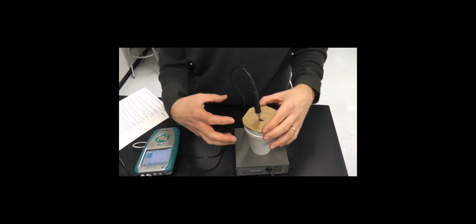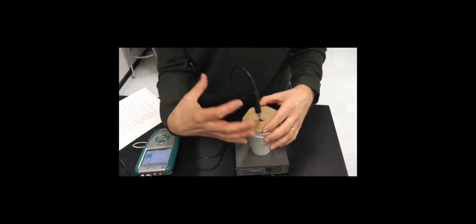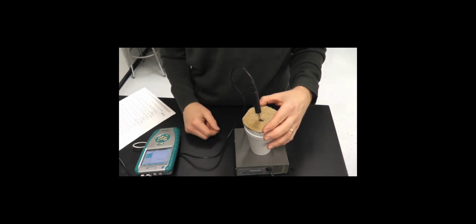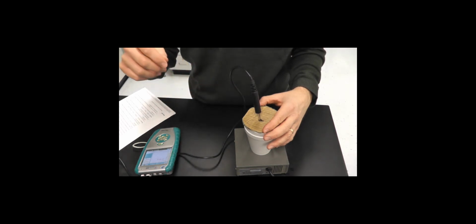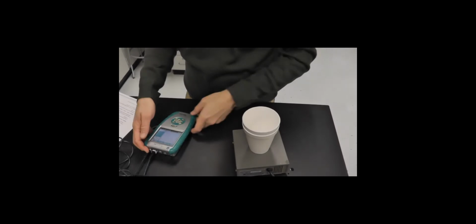So how much heat is being lost to the surroundings, not the system? We're going to find that there's heat that's lost, okay? Even though styrofoam is an insulator, it's not a perfect insulator. So anyways, that is part one of the lab, okay? So we're going to stop the video now and hop to what would be part two.